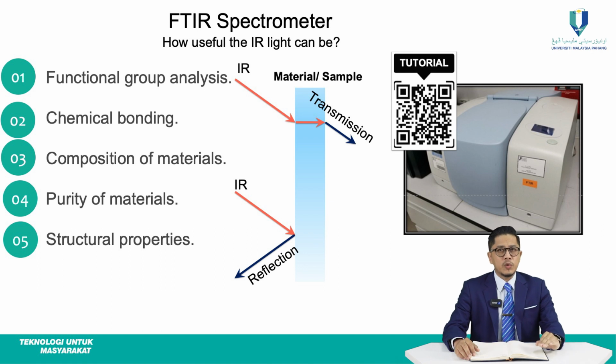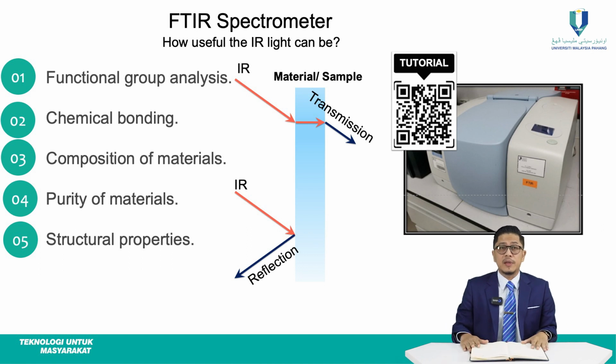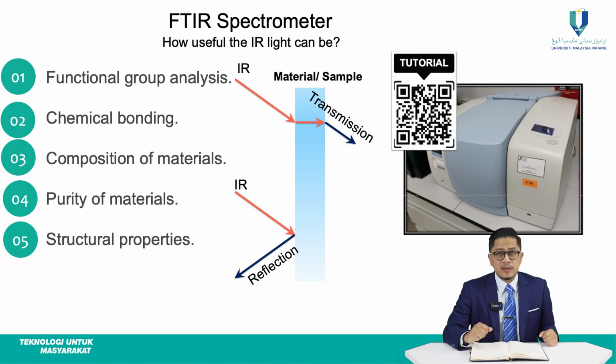They are commonly used in fields such as polymer science, materials engineering, and forensic science, where the identification and characterization of unknown substances are essential. Additionally, FTIR spectroscopy can be used for non-destructive testing and quality control in industries such as food and beverage, pharmaceuticals, and electronics.